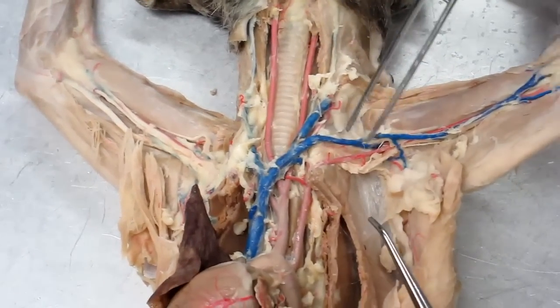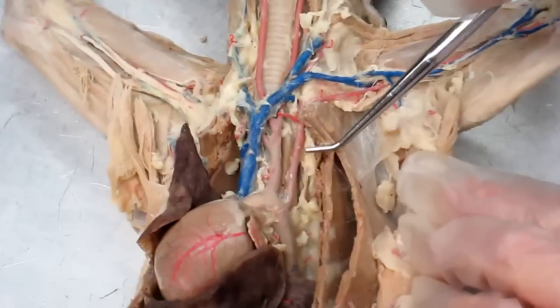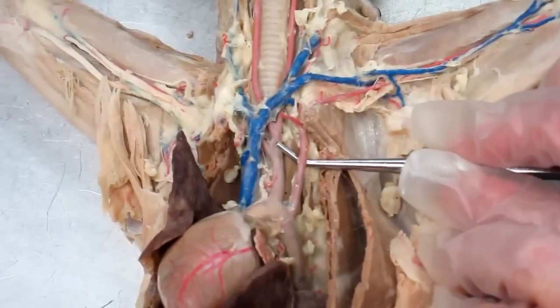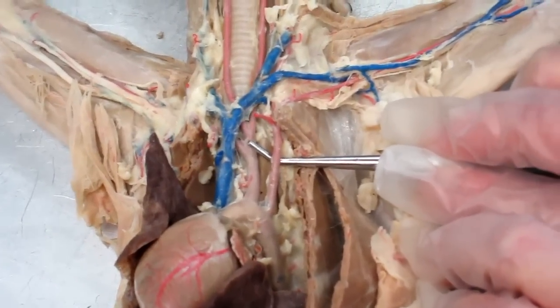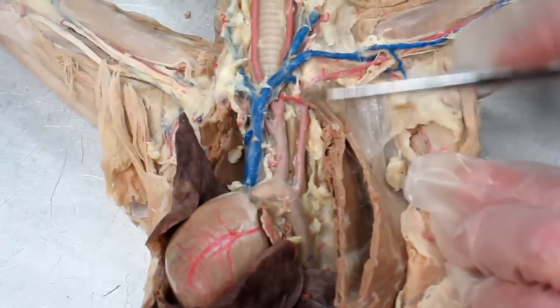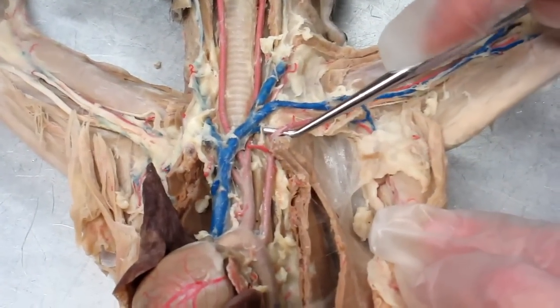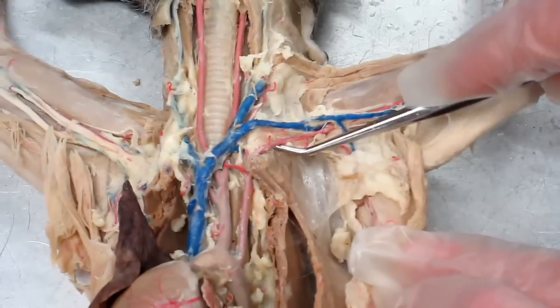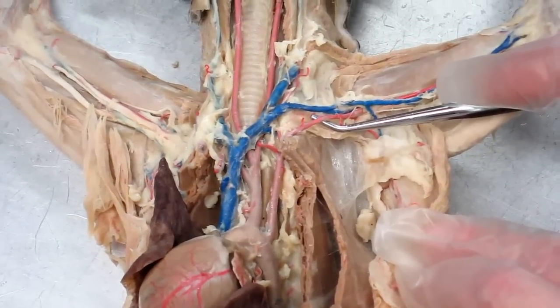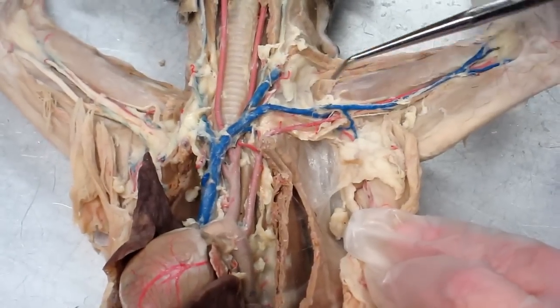Okay, now the left is dissected better than the right, so we'll do the rest of our arterial naming on the left-hand side. So we have the left subclavian, again, that's a nice long vessel that's easy to label. Okay, and as we pass the first rib, it's the same vessel, but the name changes. So we would call this now the axillary because it's in the axilla, or the armpit area of the cat.